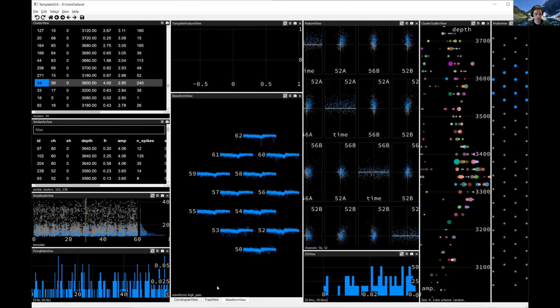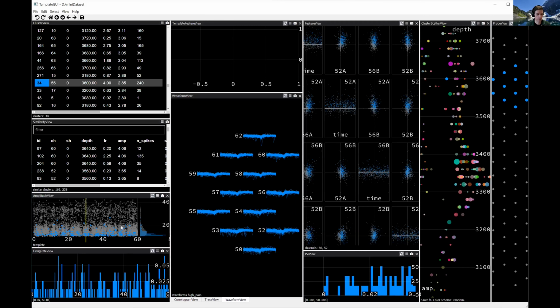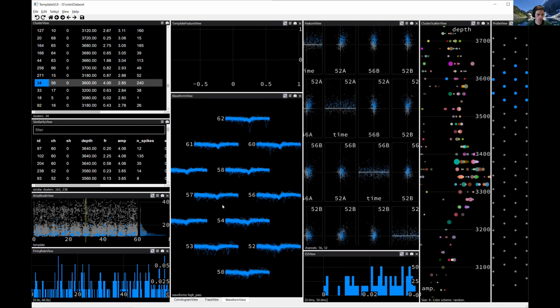This does not indicate false positive spikes. That's what's indicated by the Correlogram view, which again in this neuron does indicate some. So this neuron probably has both some false positive spikes and some missing spikes due to the amplitude cutoff. Okay, and then the last thing that you really want to look at, I mentioned before that in the waveform view, you can look for clusters that need splitting by seeing the presence of multiple different kinds of waveforms.